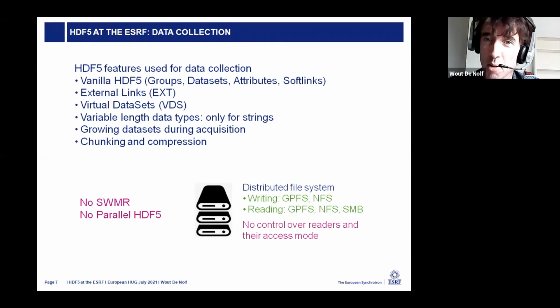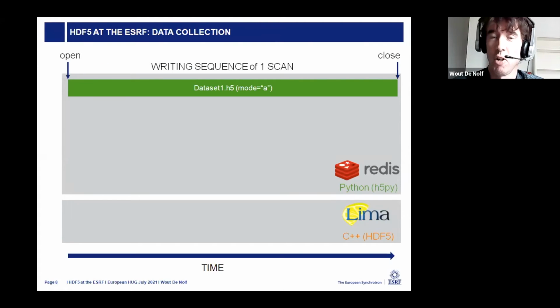To explain that a bit more in detail, I'm going to show you what happens during the writing sequence of one scan. On the top, I will show you what happens in Python. On the bottom, I will show you what happens in C++ with Lima for the images. When a scan starts, the dataset file is opened in append mode, and when the scan stops, it's closed. And then maybe some time later, a scan starts, and the file is opened again.